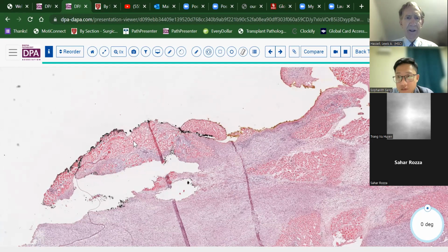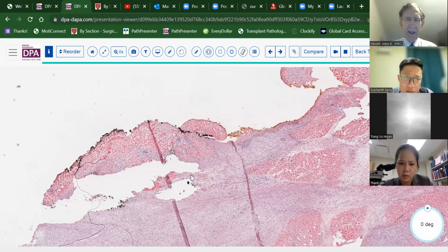And so if you just put India ink on the specimen, it will flow into every crack and crevice, as you see it's done here. This may be the surface out here, but it's gotten down into here and so forth. And that then, of course, makes the evaluation of the margin more difficult for us. We are imprecise in that sense.